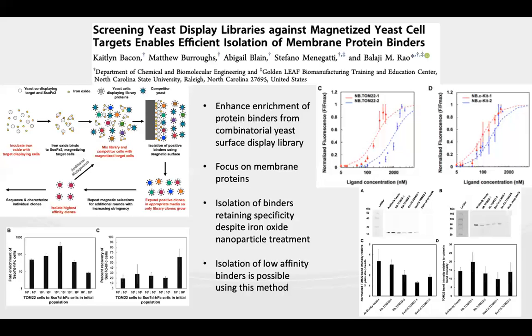When examining this use in isolating mitochondria, they were able to isolate mitochondria much more specifically than endoplasmic reticulum proteins. And this was very comparable to commercial kits that can do the same. But with their method, they could provide a greater recovery at weak affinities of about 2,000 nanomolar.